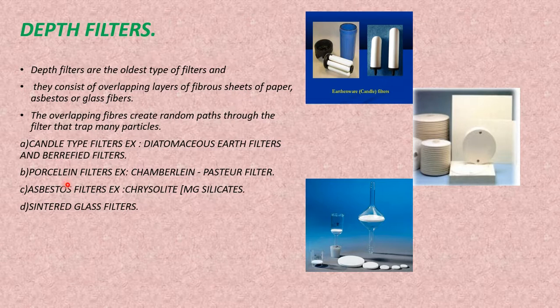And these filters are of various porosity like L1, L2. Depending upon the size, they were named L1, L2, L3, etc. Okay, and the Chamberland Pasteur filter is the best example of these porcelain filters.